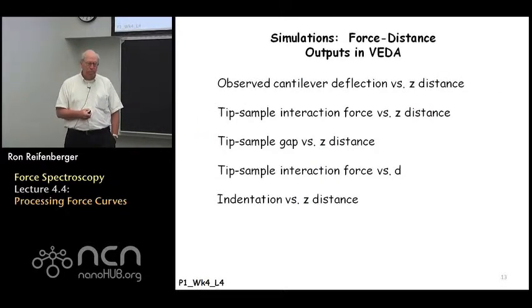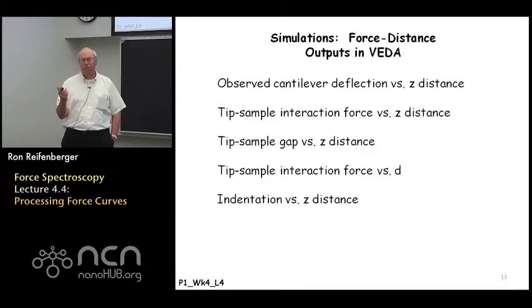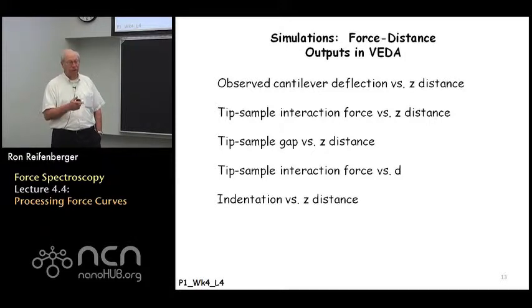So all these force versus displacement curves can be simulated accurately in VEDA. We'll talk about that in week 5 of the class. VEDA then allows you to get a large number of different outputs, which are very helpful in trying to understand some of the basics behind this very simple experiment. But it's very powerful because it tells you something fundamental about how the tip is interacting with the substrate. So we'll talk a little bit more about this in week 5.